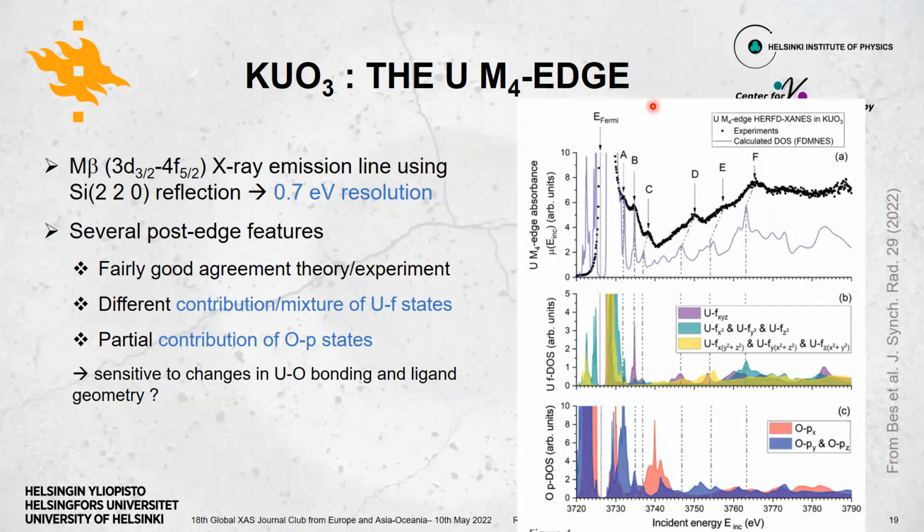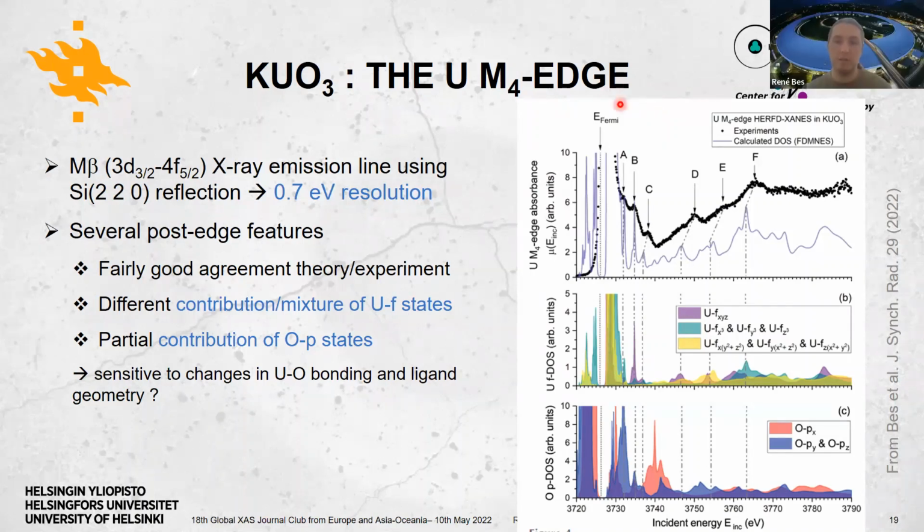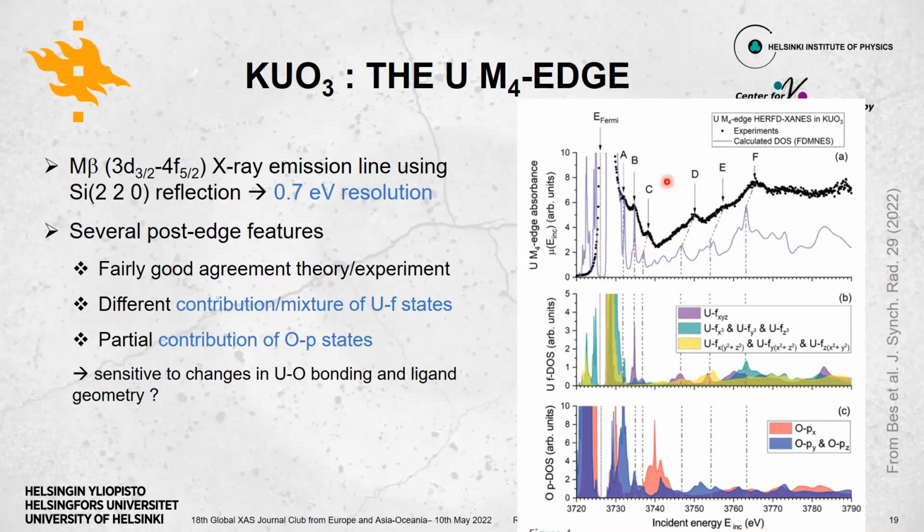So if I understand correctly, your answer is you have tried different lattice parameters and you don't observe a linear shift as expected. The shift doesn't go well with the lattice parameters. Yeah. It improves a little bit the higher energy side, but then it degrades a little bit the position of the low energy side. So it has a non-linear effect depending on where you are situated compared to the white line. Okay, yeah, I understand. Thanks.